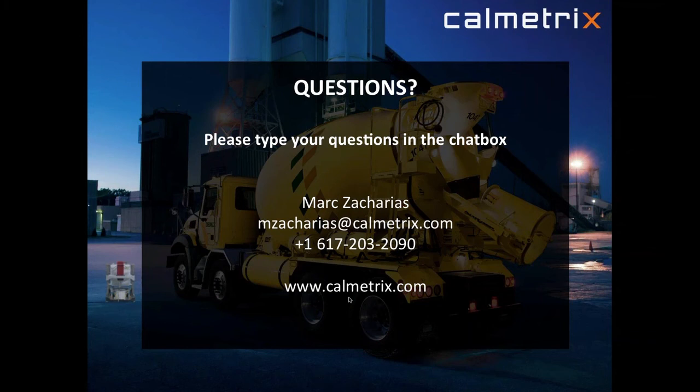We have one other question from Wei Hu. How do you determine the yield stress and viscosity of the mixture? Okay, that's a very good question, because here you have a trade-off. It is widely accepted that you use the Bingham model when you look at concrete rheology, and the Bingham model works for certain geometries of the impellers and of the vessels. A plate geometry works with the Bingham model, a cylinder, so a bob in a cylinder, works with the Bingham model. A vane would work with the Bingham model as well.